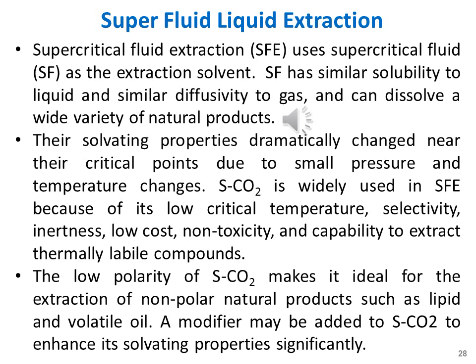Supercritical fluid extraction, or SFE, uses a supercritical fluid, abbreviated as SF, as the extraction solvent. A supercritical fluid is any substance at a temperature and pressure above its critical point, where distinct liquid and gas phases do not exist. It can effuse through solids like a gas and dissolve materials like a liquid. In addition, close to the critical point, small changes in pressure or temperature result in large changes in density, allowing many properties of a supercritical fluid to be fine-tuned.